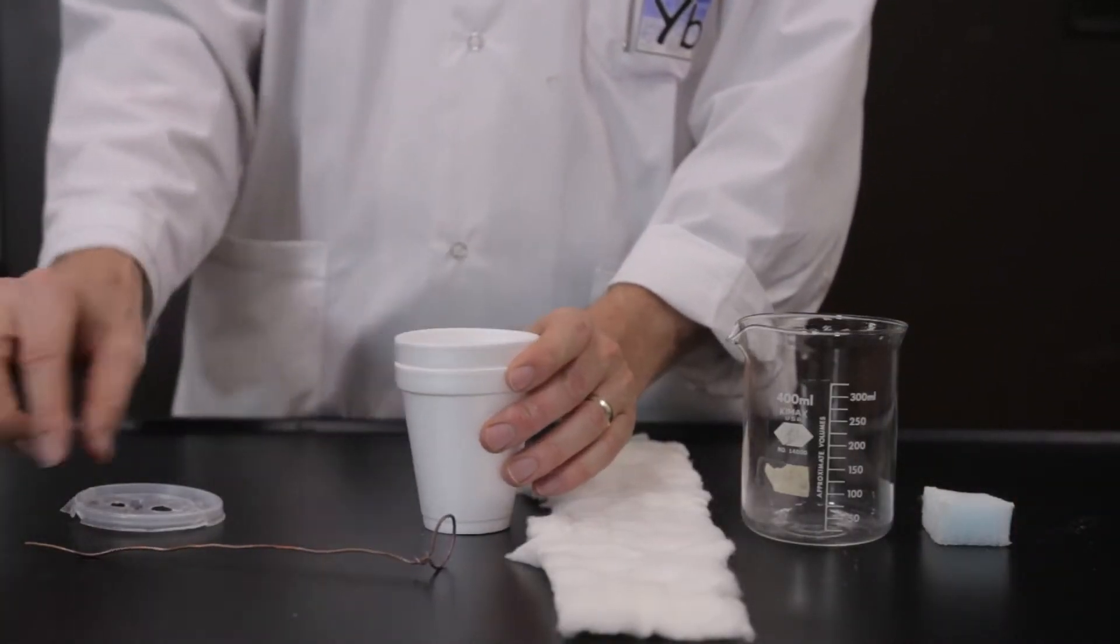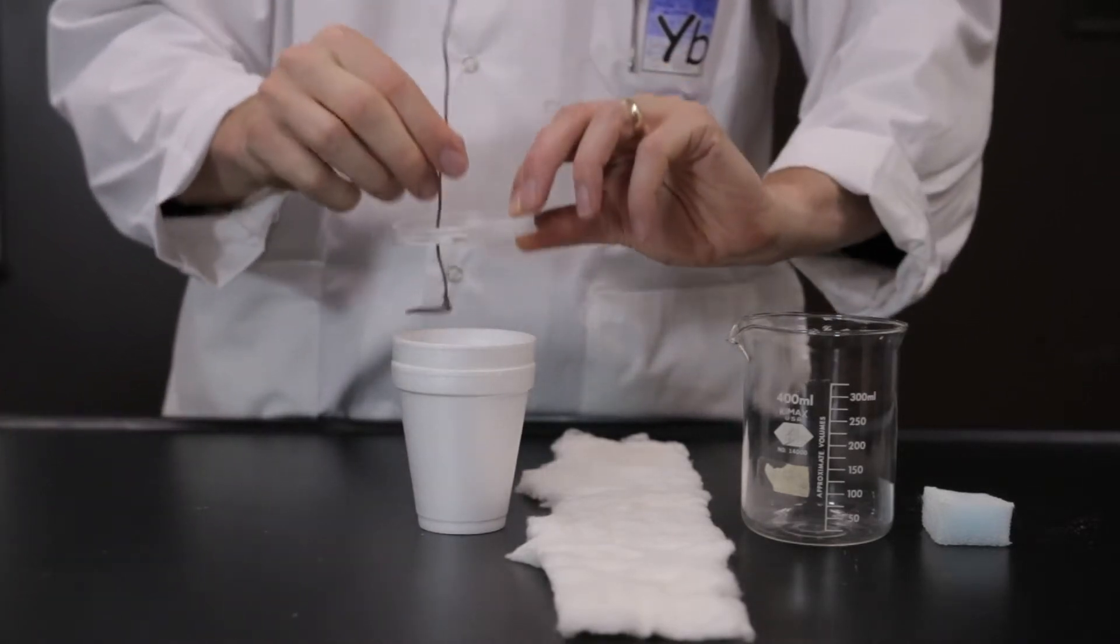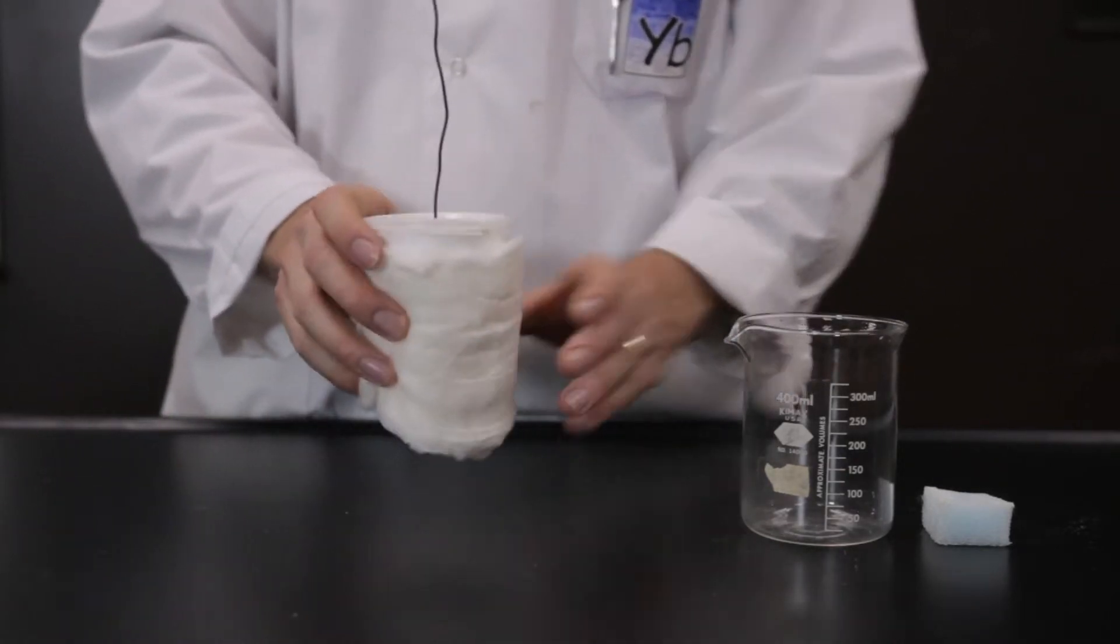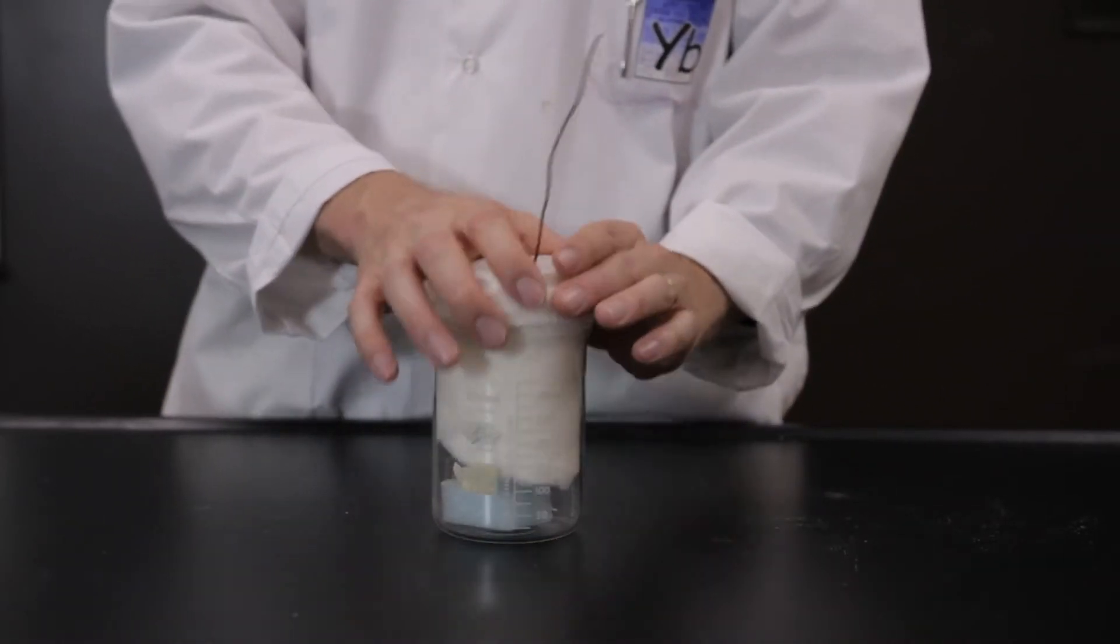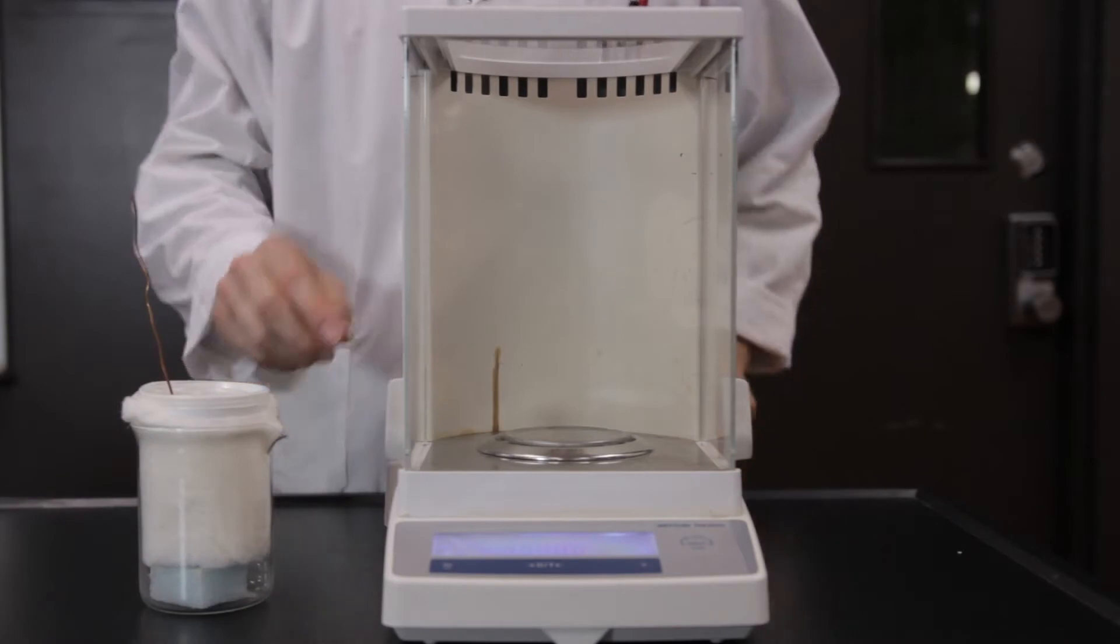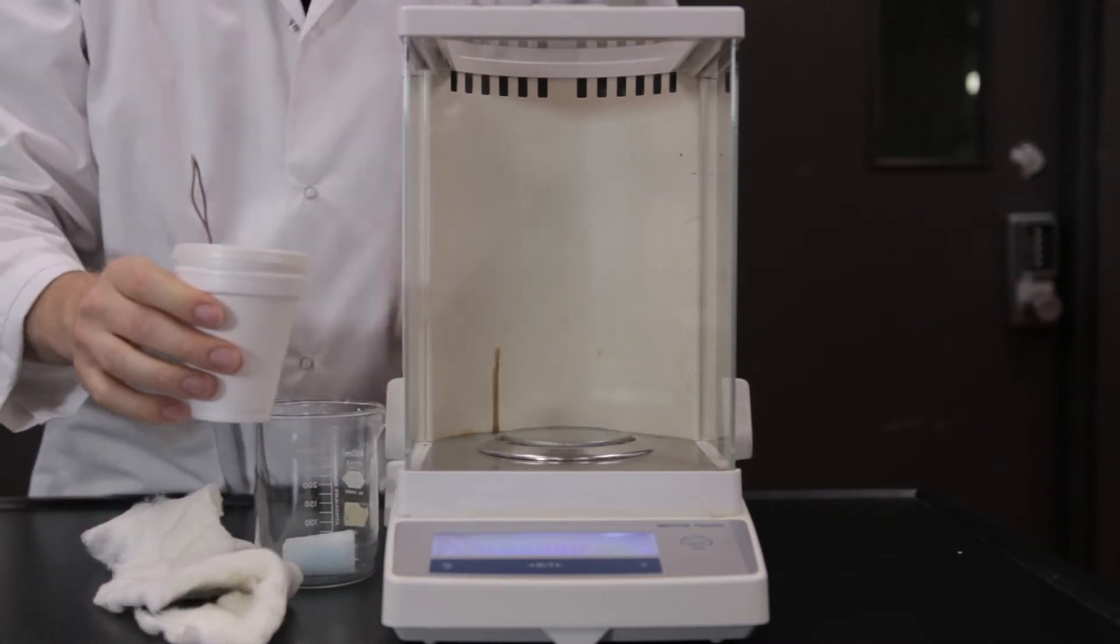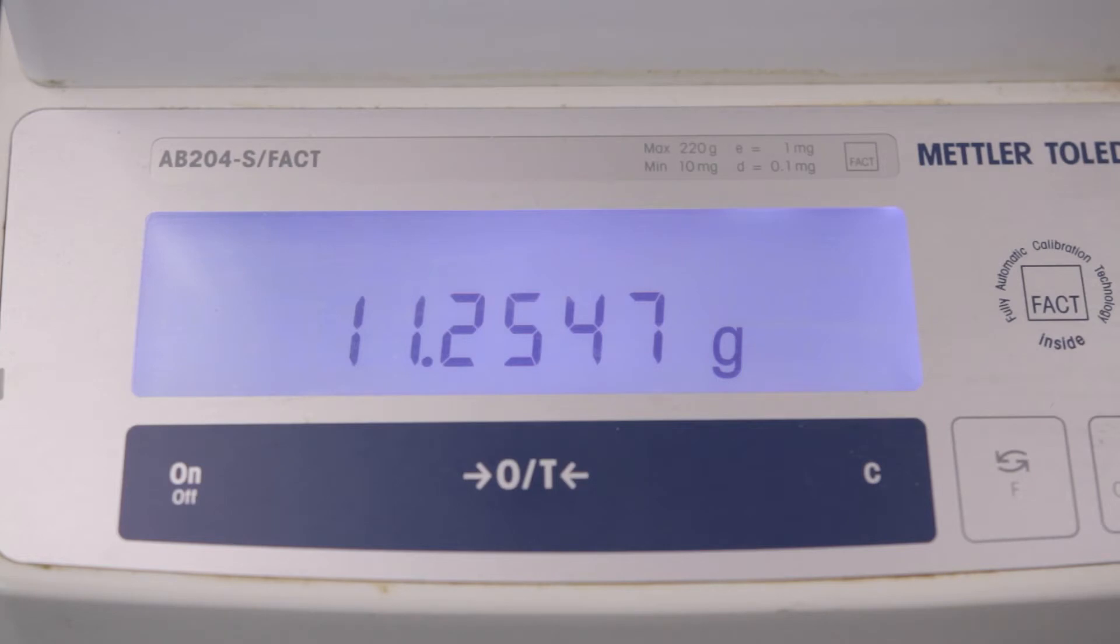Assemble the coffee cup calorimeter. Weigh the empty calorimeter, which is made up of two cups, a lid, and the stirrer on an analytical balance. You will have to bend the stirrer to fit the calorimeter in the balance. Make sure nothing touches the inside of the balance. Record the exact mass on the datasheet.